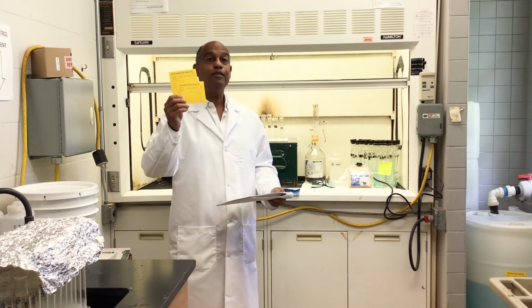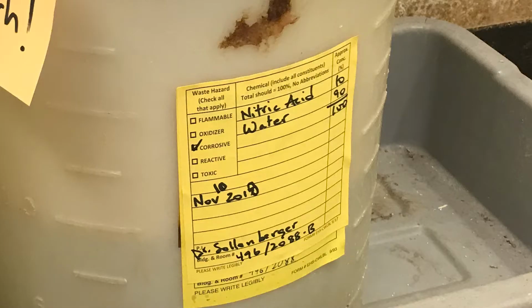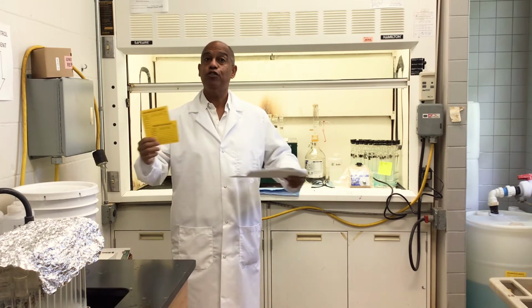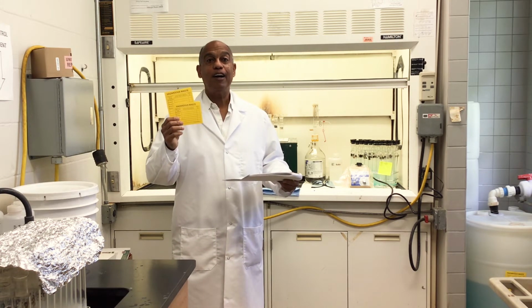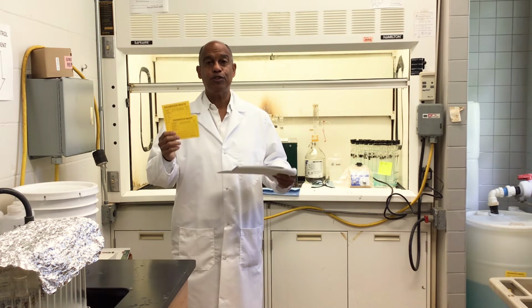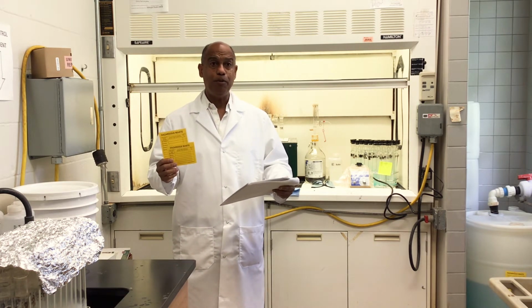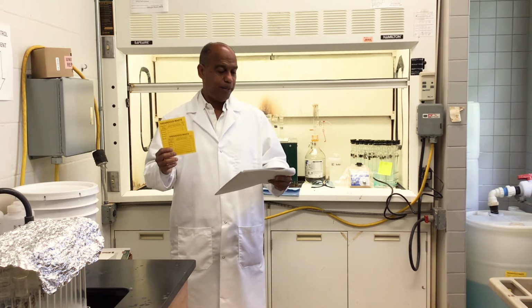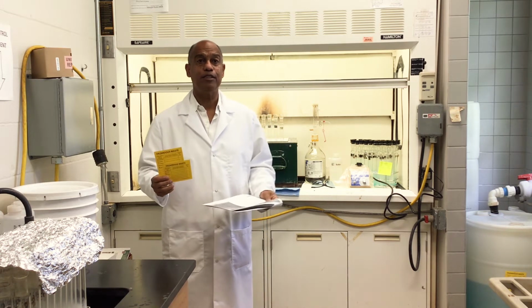Now for reagents and chemicals that are hazardous waste, dangerous. A hazardous waste is a chemical that you're done using. So once you're done using it, what do you do with it? Have we thought about that? We need to think about hazardous waste and where it goes and how it is treated. It should be an essential function in a laboratory. So the chemicals must be clearly labeled, they must be stored properly and disposed of in an appropriate manner. An emergency list should also be established in case of emergency.